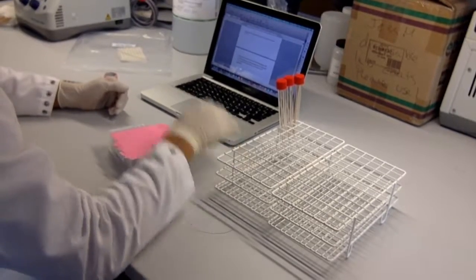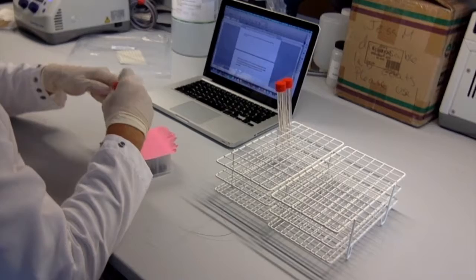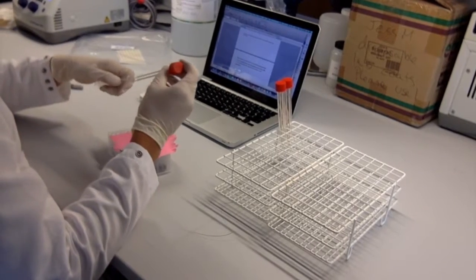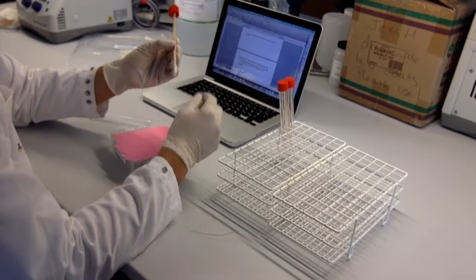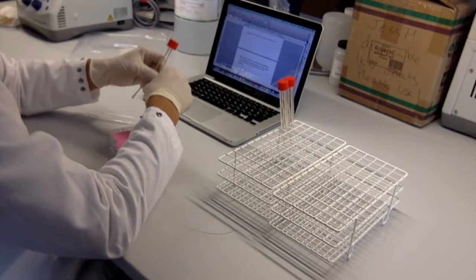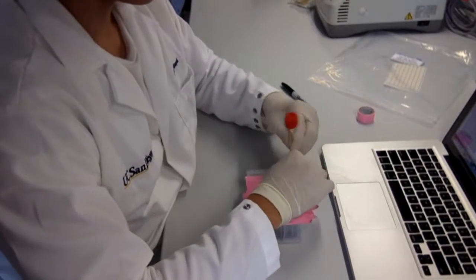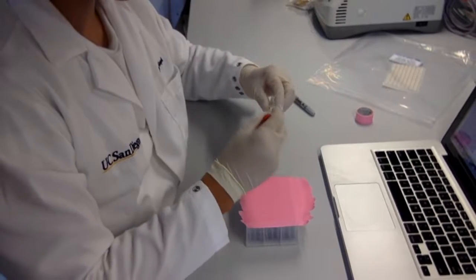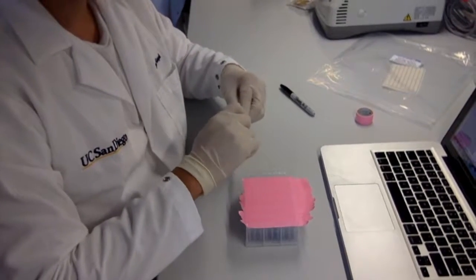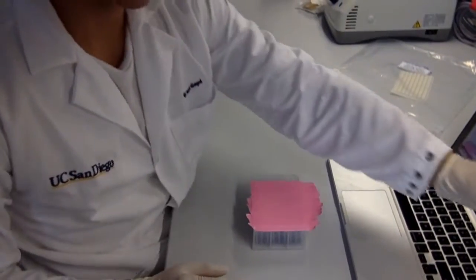Step 9: Place the A1 swab into the corresponding PowerSoil plate A1 well. Be careful not to move the sample over any other wells. In the double swab form, make sure the swabs are well separated. Step 10: Break off the swab into the appropriate well. Make sure that the swab is not flush with the surface of the well, but instead it should be short enough to ensure that the rubber plate mat can securely reattach.